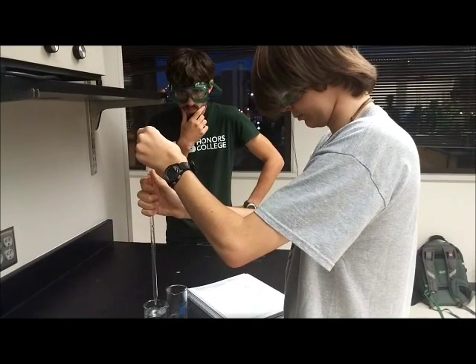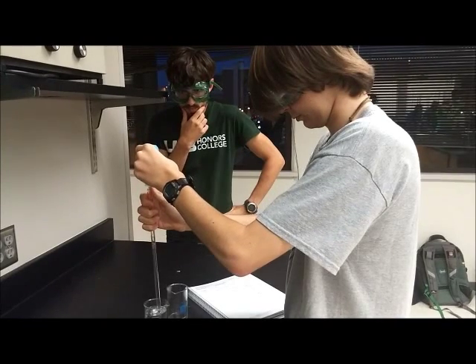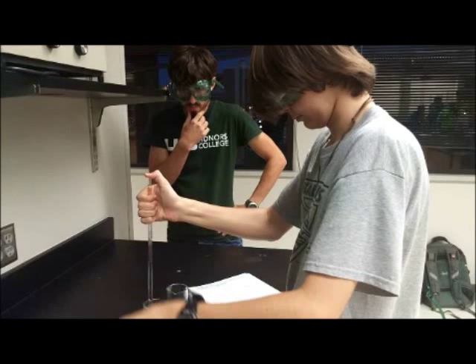First, squeeze the bulb before putting the pipette into the solution itself. Slowly release the bulb to pull water into the pipette. Before removing the tip from the solution, remove the bulb and quickly replace it with your thumb.